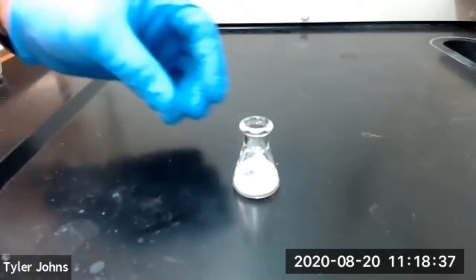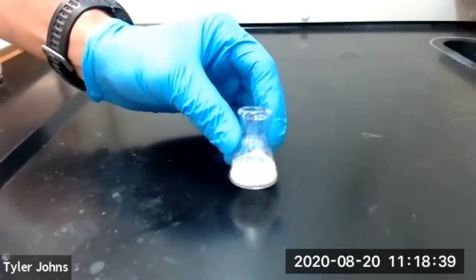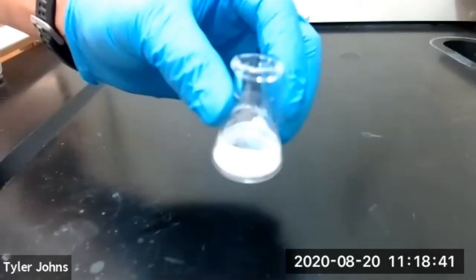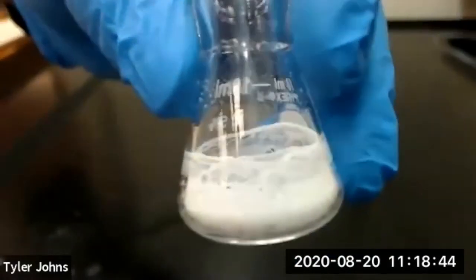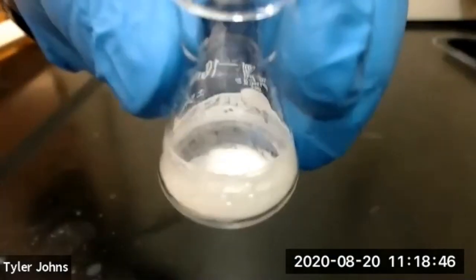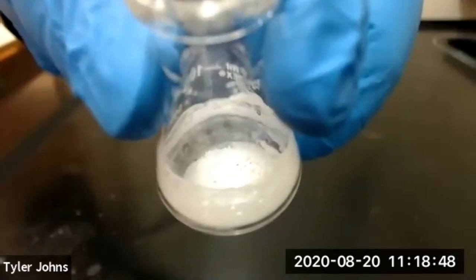We've evaporated all of the methylene chloride from our 10 milliliter Erlenmeyer flask. At this point we will weigh the flask to determine the amount of caffeine that was in our methylene chloride.